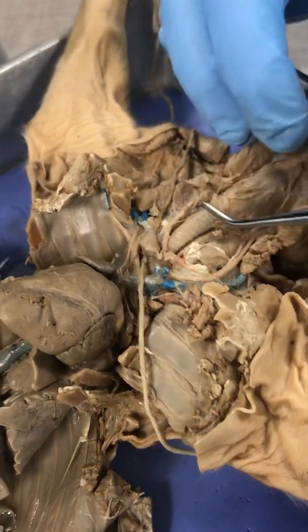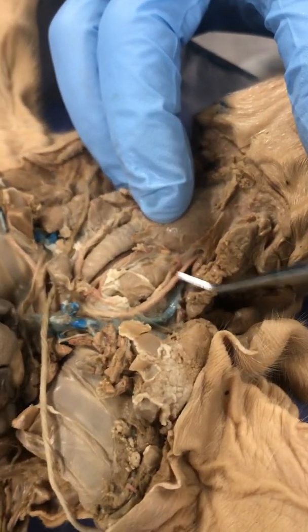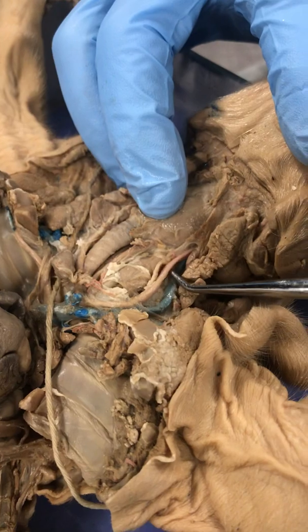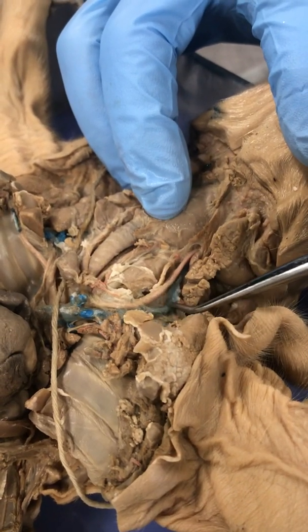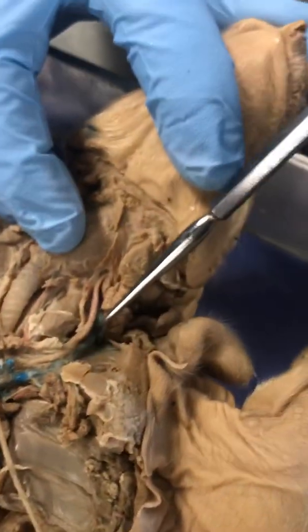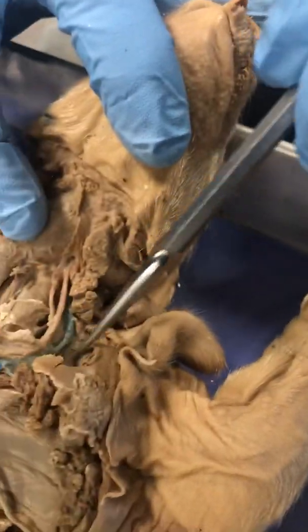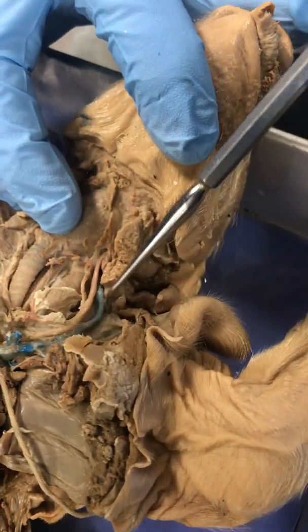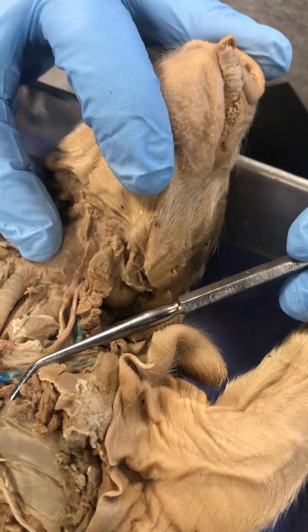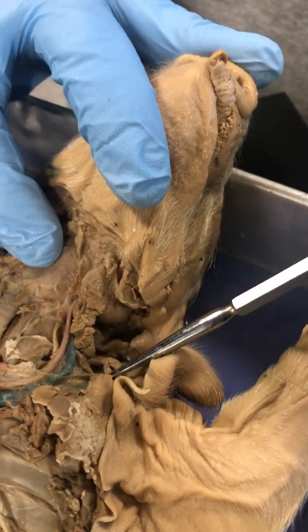And then, of course, you can see the common carotid as well as the vagus nerve. So there's the vagus, here's the common carotid. This would be the internal jugular, and you can just barely make out the external jugular that's coming off just outside of that. It's a little deeper, but it comes up at an oblique angle. Internal jugular, external jugular.